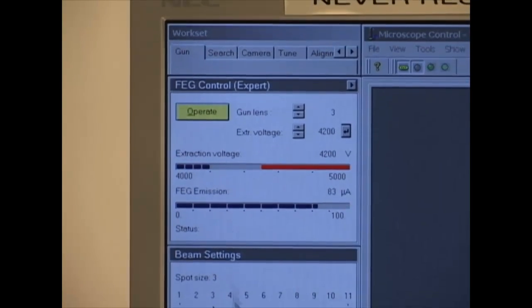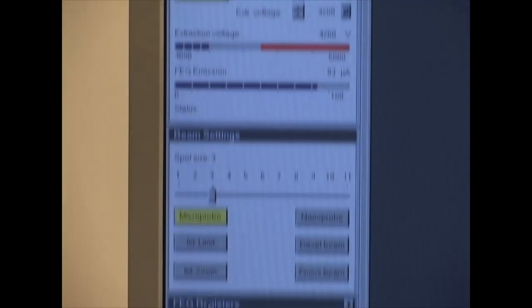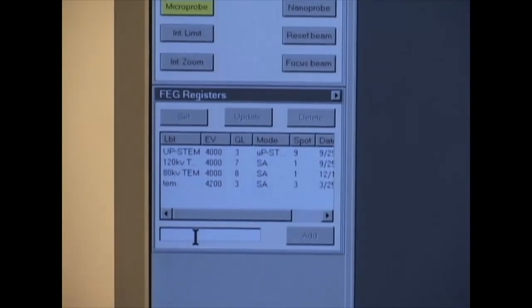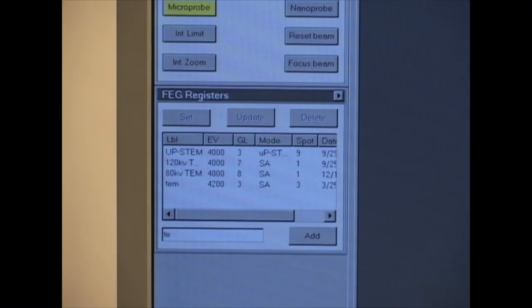Click Gun, FEG Registers. Type a name like TEM and save the alignment settings for future use.